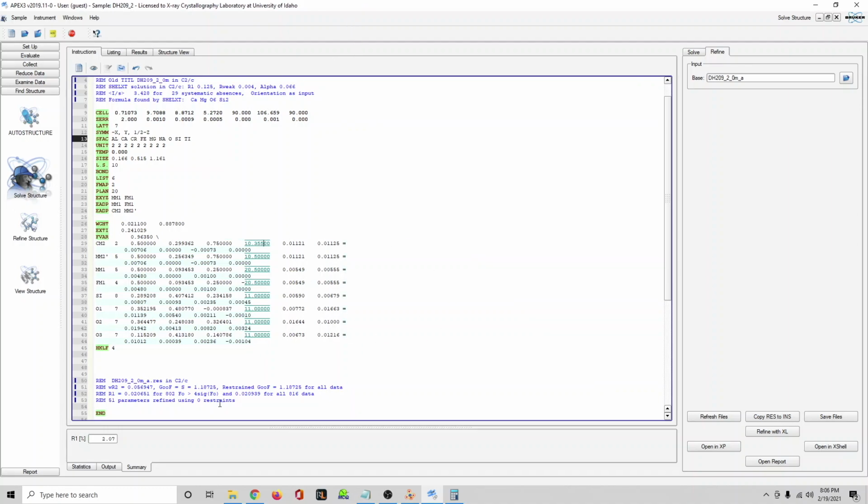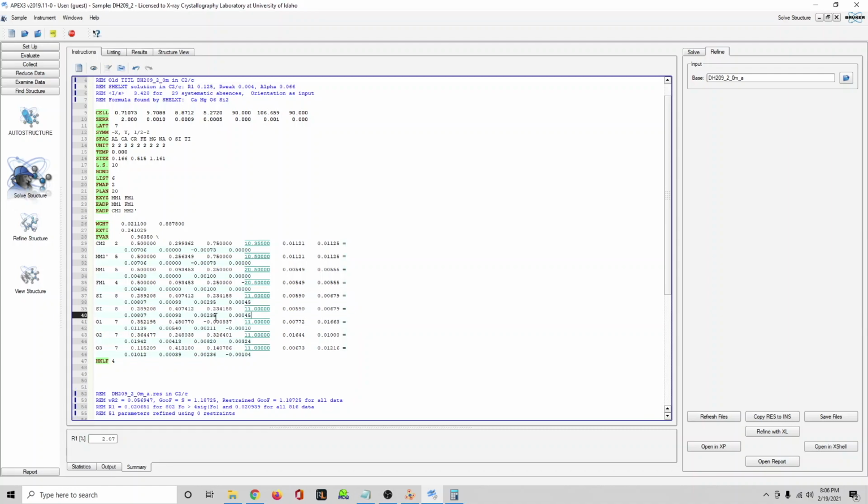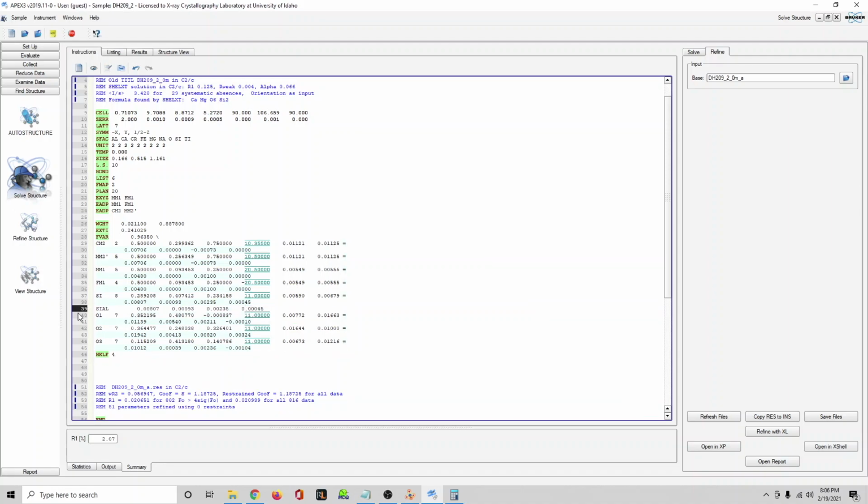And you'd go through that with everything, including silicon, which we would actually split. So we'd split that, same position, except we want the other position to be aluminum, because we know that silicon and aluminum coordinate in the same site, and I don't know why it just did that.